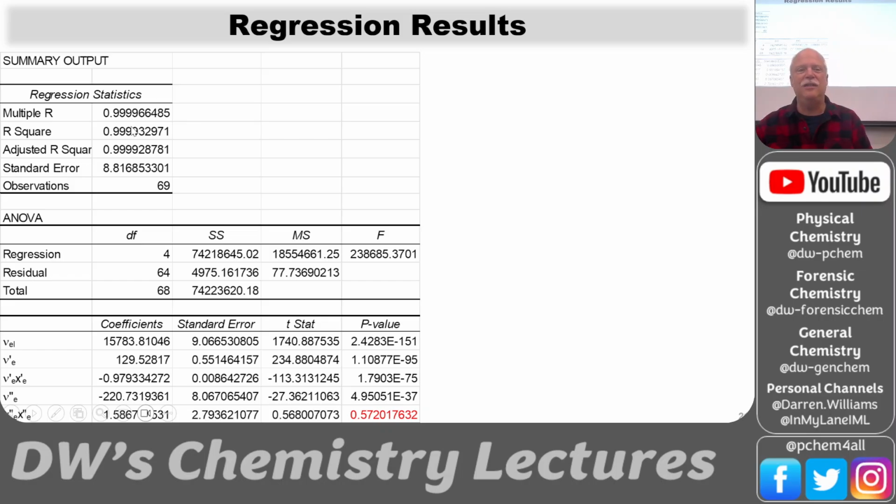Not as good as the rotational vibrations because this assignment is much more difficult in terms of finding those little spots where you're picking the peaks. It's much easier to pick peaks in the P, Q, and R branches, or P and R branches for carbon monoxide. And so why is this one so big? This is one of the discussion questions.